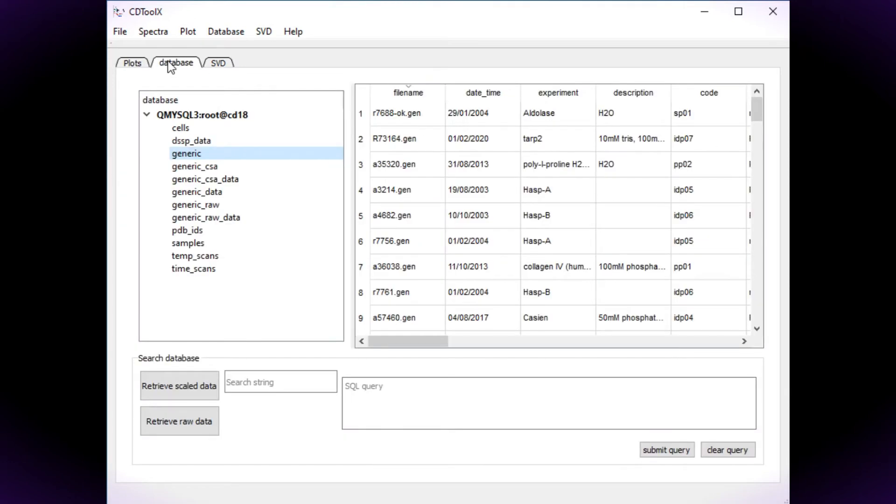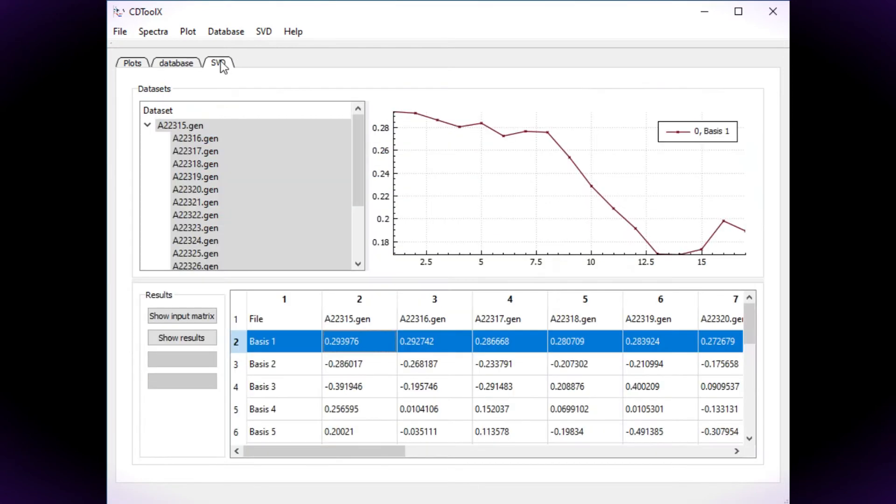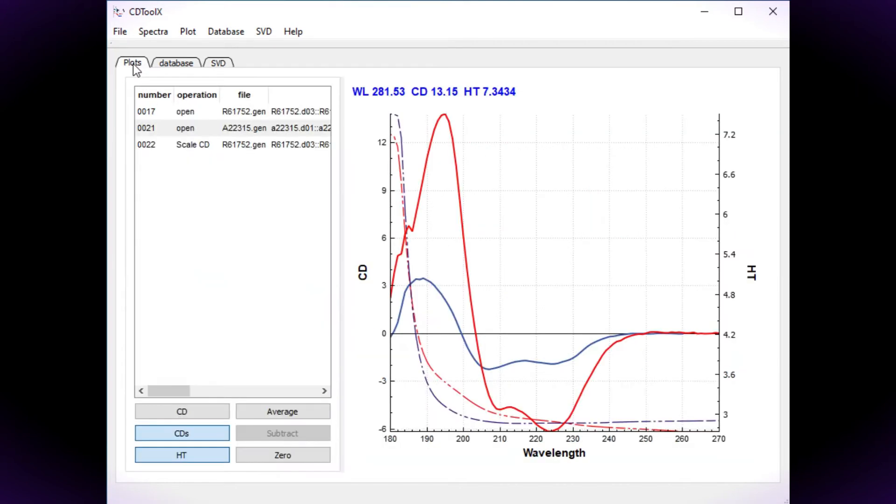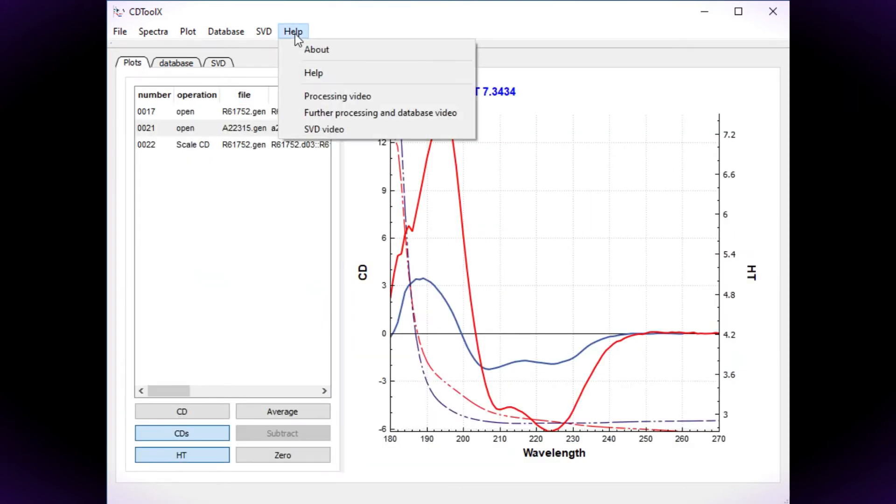The database tab contains functions for archiving your processed data in a MySQL database and the SVD tab enables the single value decomposition of datasets. The database and SVD functions are described in other videos which you can access from the CDToolX website or from the Help menu.